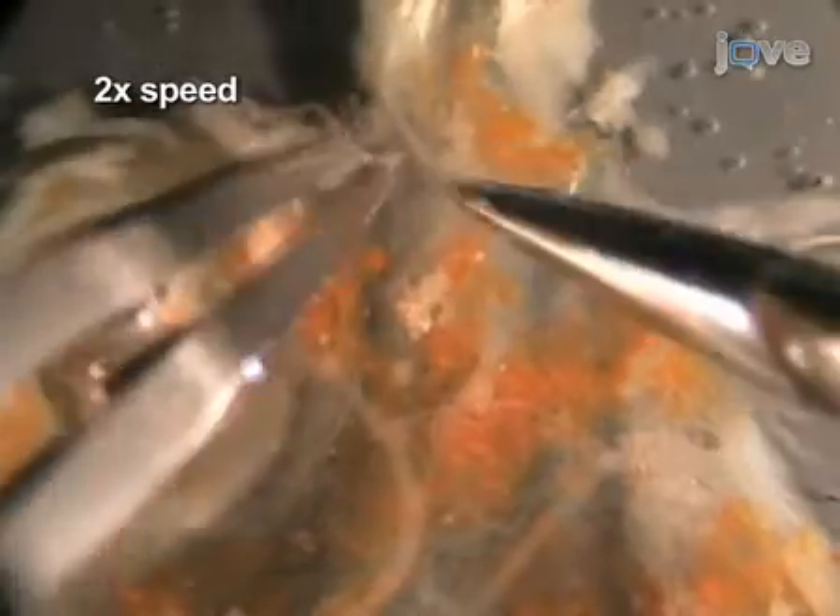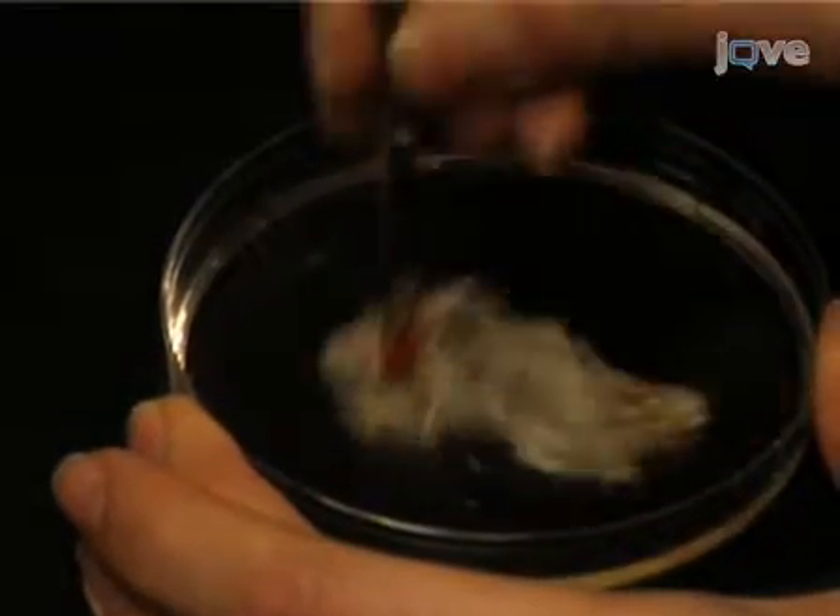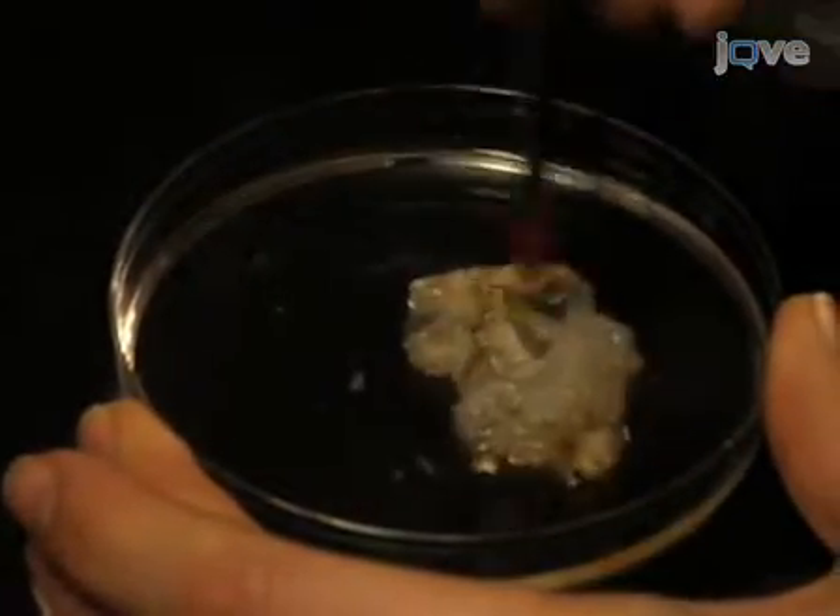Once all of the nerves have been uncovered, sever any remaining connections between the STNS and the stomach. Carefully move the STNS away from the rest of the stomach, cutting any missed connections. Prepare the clear silgard dish by rubbing some stomach tissue over it until it feels wet and less sticky. The STNS will adhere strongly to the silgard if the dish is not conditioned in this manner. Then add some fresh cold saline to the dish.